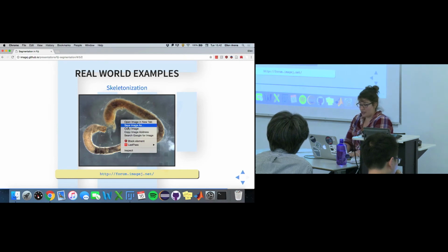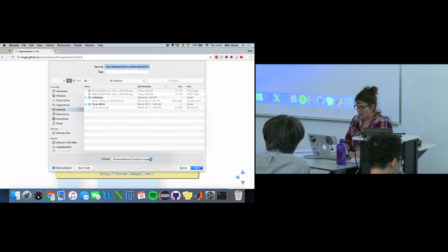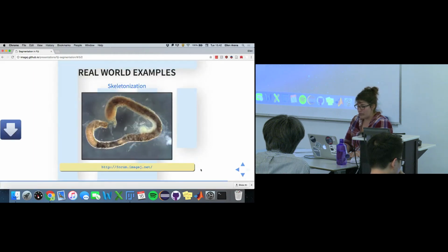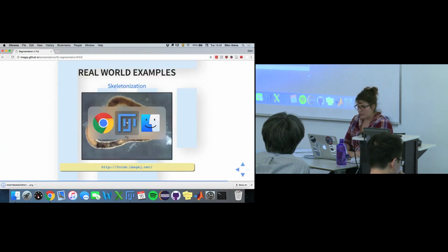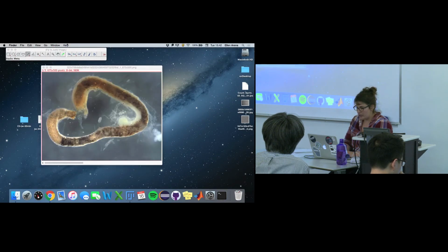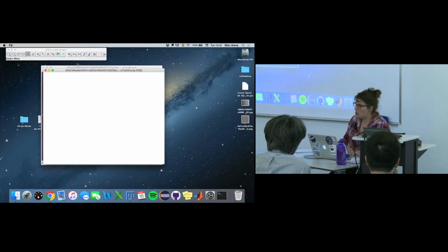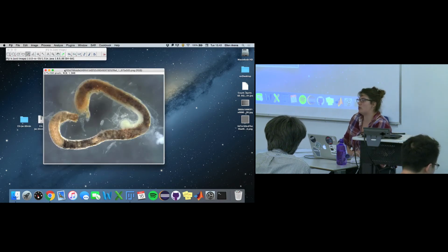But if you want to follow along, it's awesome because of muscle memory. It'll help you remember how we did this. So again, I'm just going to quick drag and drop. And I'm going to first just convert this to RGB color. Okay, just close the other one. So we have an RGB color. And what's cool about this one is that we can actually just threshold this image as well, but this time we can threshold on color.